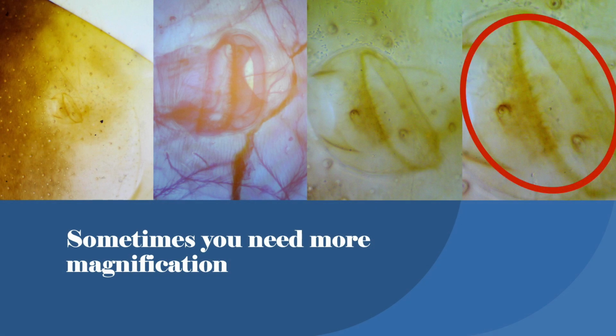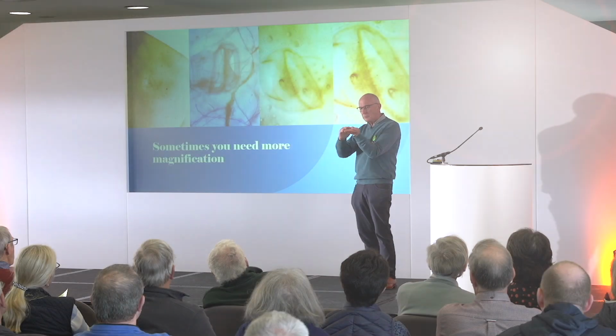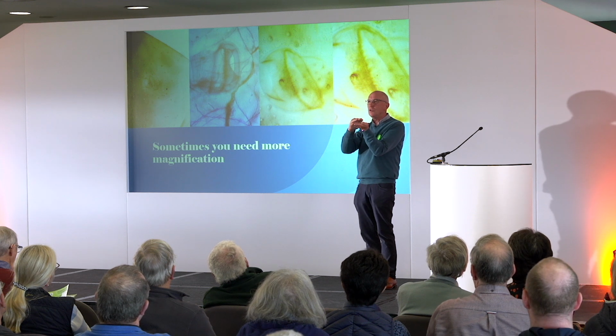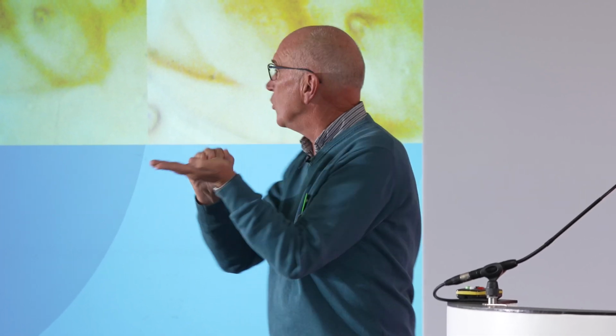And then this is too big, because when you have a specimen, the level of detail you can go down to can blur if you magnify it too much, or it's not enough detail if you don't magnify it enough. So what you have to do is judge. It's not like always going for the fastest car. You have to choose the magnification which is appropriate.